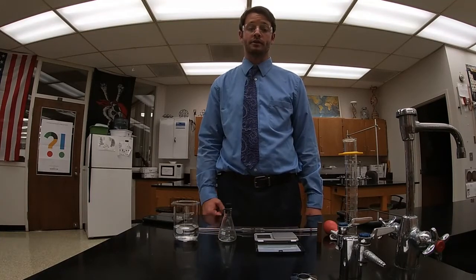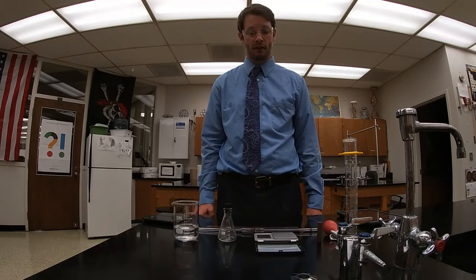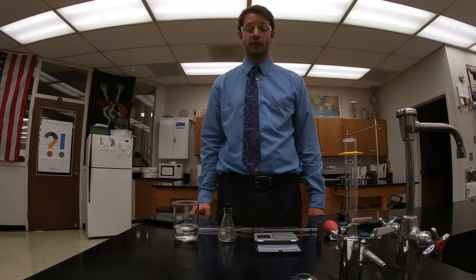This lab has three parts. The first part is using the centigram balance, the second part is using the pipette, and the third part is determining the density of an object.